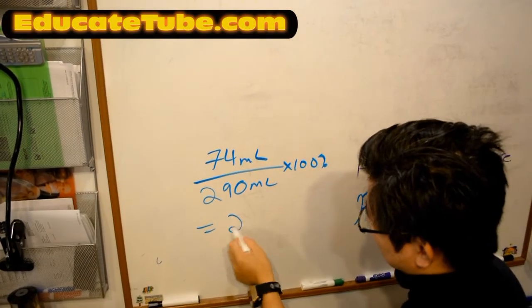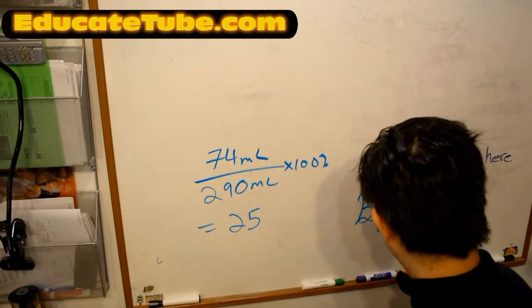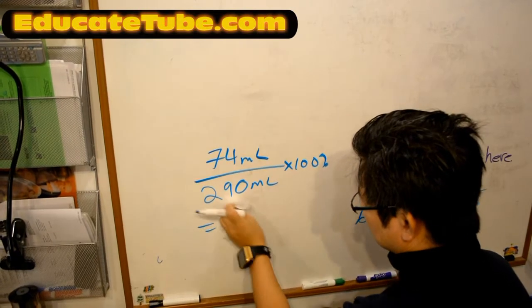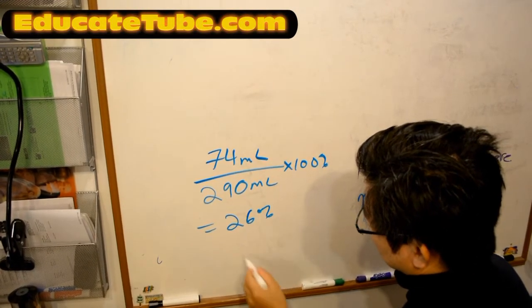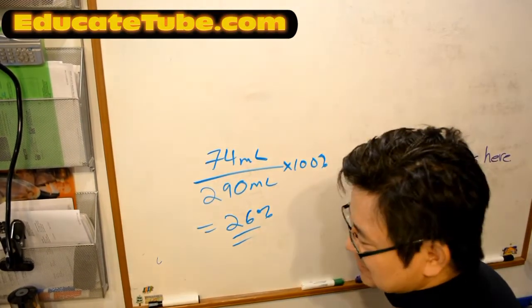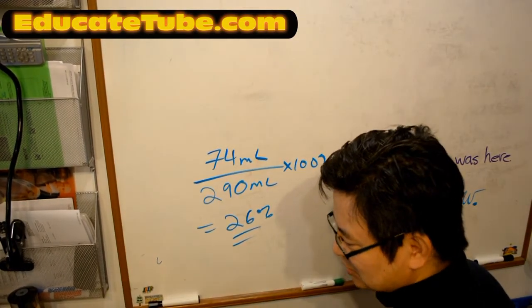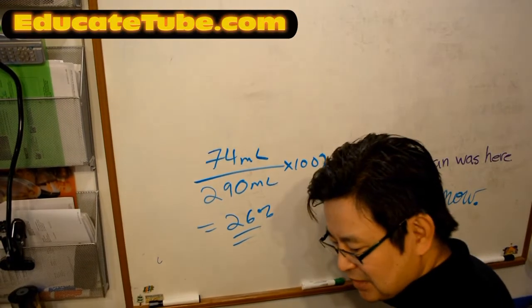That means I only achieved 25, I think 25.5, which if you round it, I only allow 2 significant figures accuracy, so we have 26% yield. Not good at all. Gotta repeat this experiment again to see what's wrong with it. We gotta do it at least one more time. It was a good start, but not good enough.